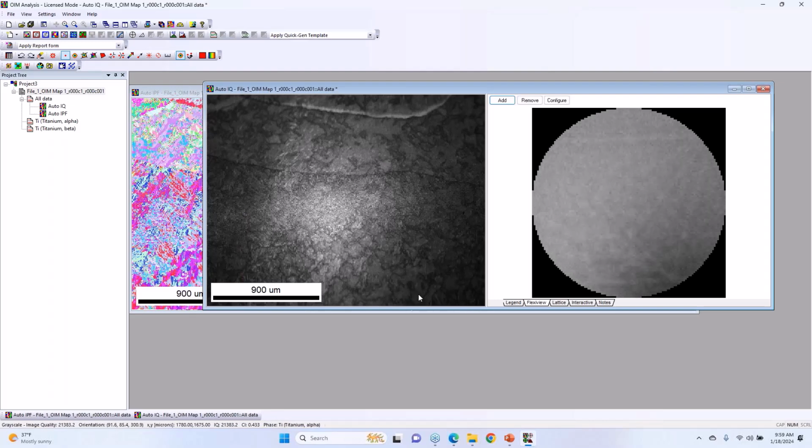When we collect Montage data, we have two different options. One is we can just collect it all as a data set. We just set top left, bottom right, go, and it puts them all together. That's kind of the brute force method. The option I typically use when I'm trying to get good data is I do multiple fields, save them each as a field, and have some overlap so it can identify things, and I can save the patterns and do this other processing. And that's where batch processing comes in handy as well.